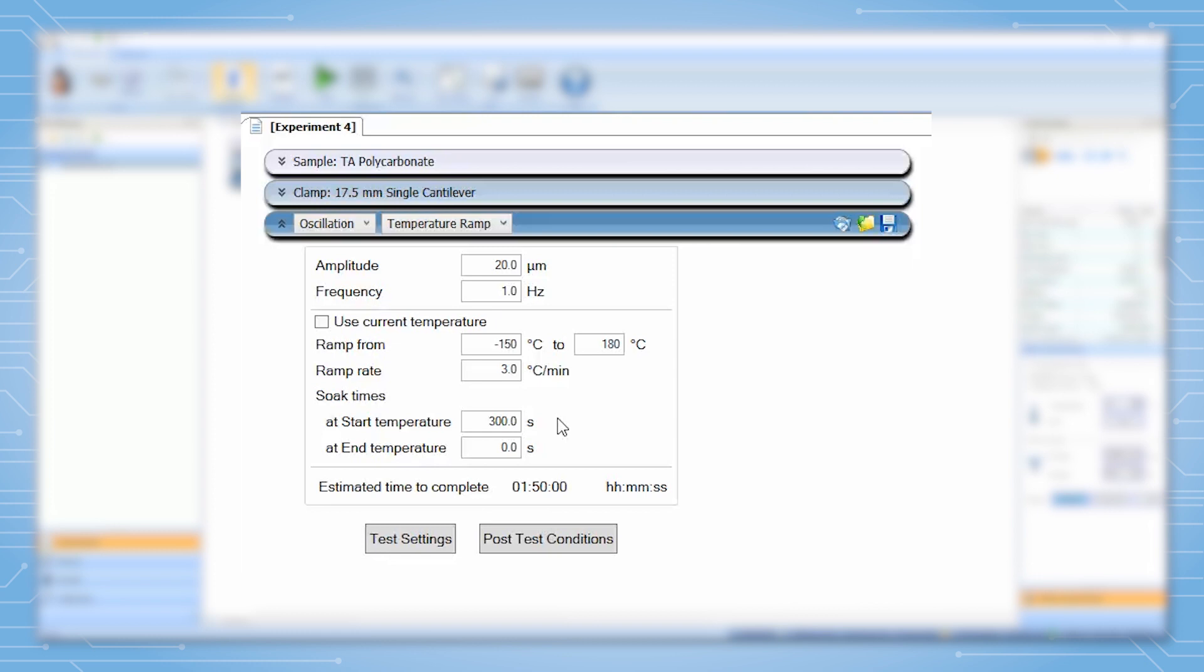At the end temperature we can set a final soak time to make sure that the instrument reaches the final temperature and the sample is stable. The high temperature should not be set such that the sample melts or degrades in the furnace.